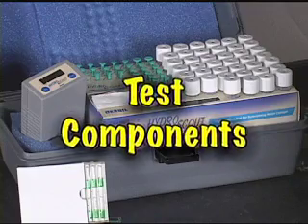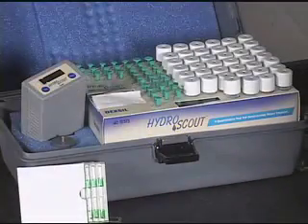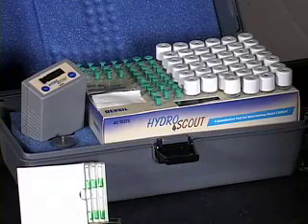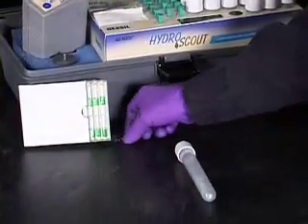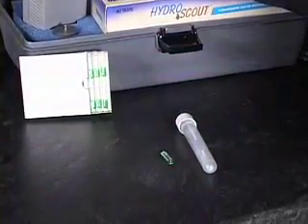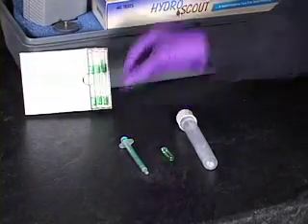Test Components: Set aside the following HydroScout components — one reaction tube with a black rubber septum and a plastic straw containing a reagent ampoule, one green disposal ampoule, and one green sampling syringe.